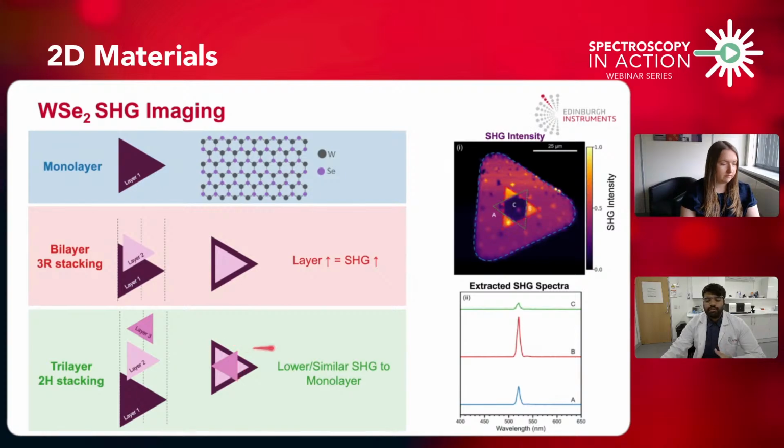Now, I've represented here one of the potential ways that this could be stacked for a tri-layer system. In this instance, we can see that layer 3 is actually oriented 180 degrees with respect to the other two layers. Because of this rotation, we've now partially restored some of the centrosymmetry. And as Angela had mentioned, once we restore symmetry with the two pancakes, this is where we start to lose some of our SHG signal.